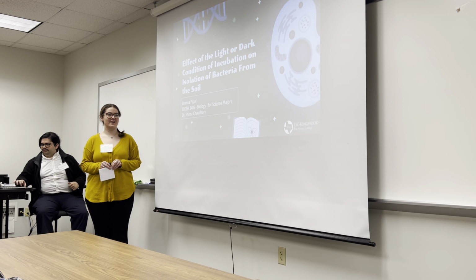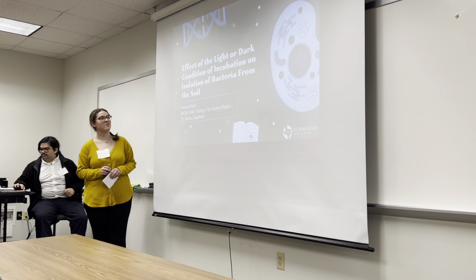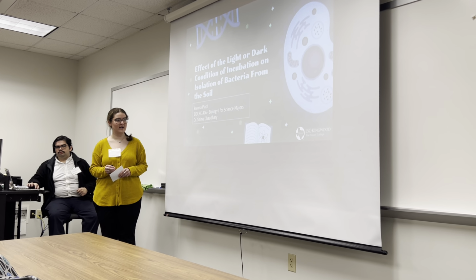from Ploof. I am a first year student at Lone Star College, and today I will be talking about the effect of light or dark incubation on bacteria, trying to find different isolates from soil.